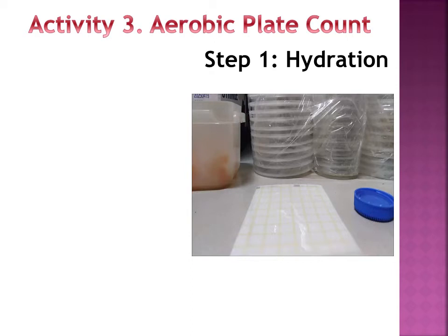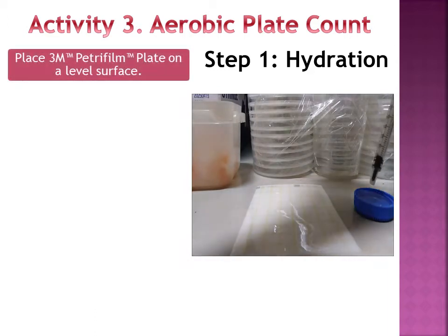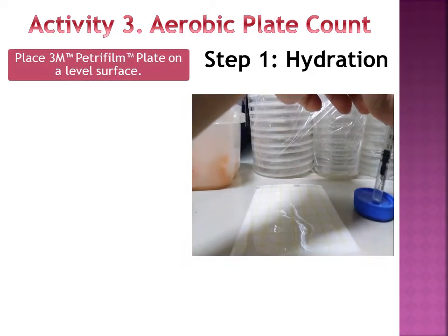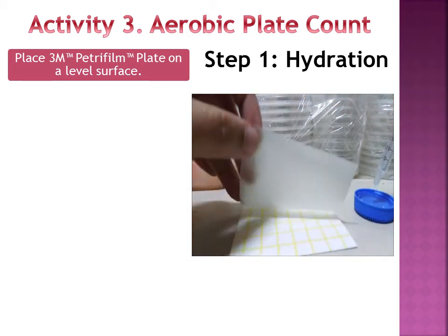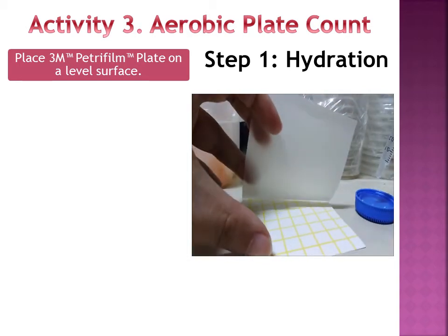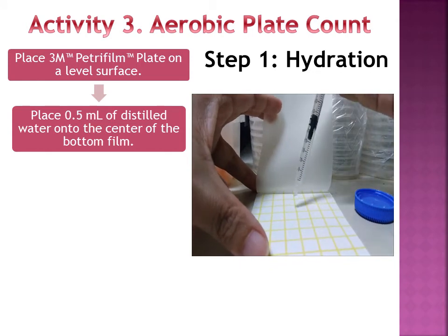You may wipe this area with alcohol. The first step is the hydration of petrifilm. Place the 3M Petrifilm plate on a level surface. Place 0.5 ml of distilled water onto the center of the bottom film.